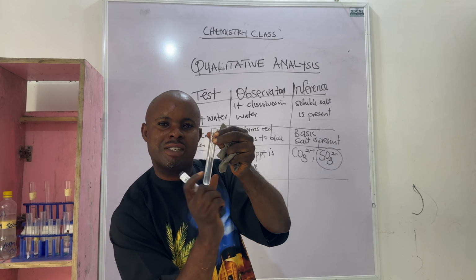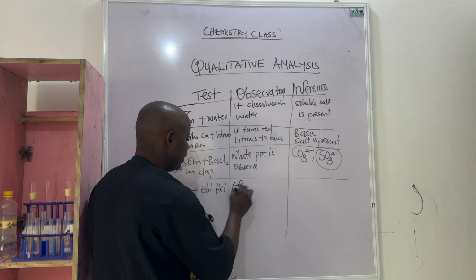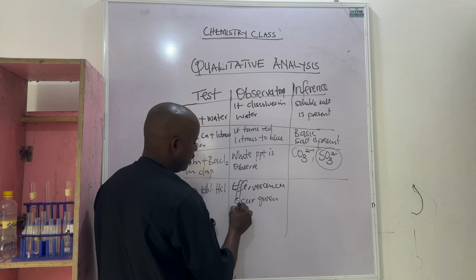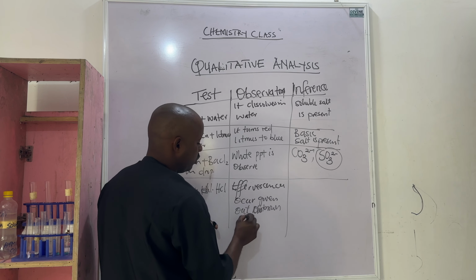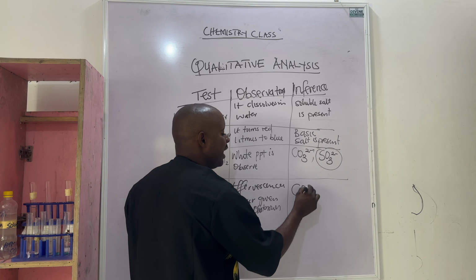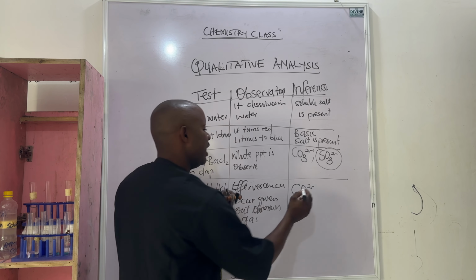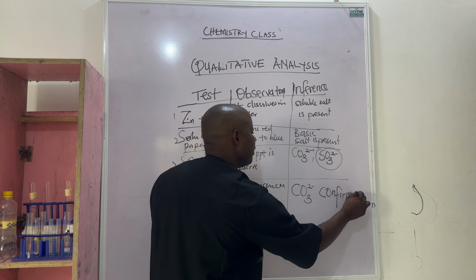So a major characteristic of the carbonate family is that you can see the effervescence occur, giving out an unknown gas. You don't actually know the gas. So what gives these characteristics is the carbonate family. When dilute HCl is placed on a white PPT, it dissolves it and gives out effervescence, making the solution clear, and this family is confirmed. This is the major characteristic of the carbonate family.